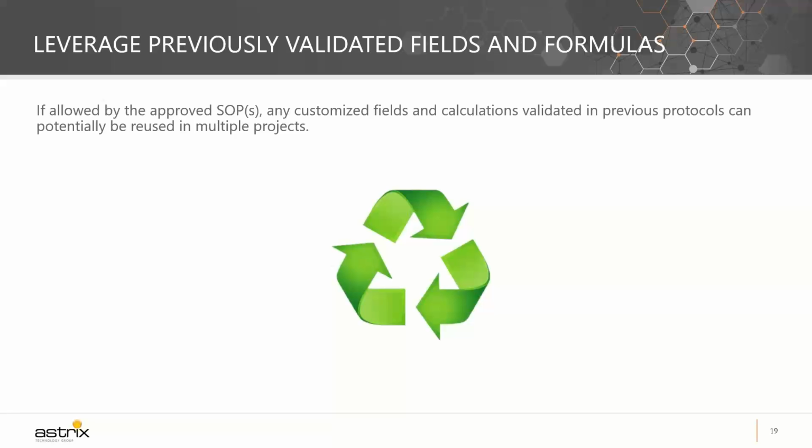Another thing to make sure that your formulas are doing what they were supposed to do, one key topic to work during validation of customized calculations is the option to leverage previously validated fields and formulas. So if allowed by the approved SOP you built upfront, any customized fields and calculations validated in previous protocols can potentially be reused in multiple projects.